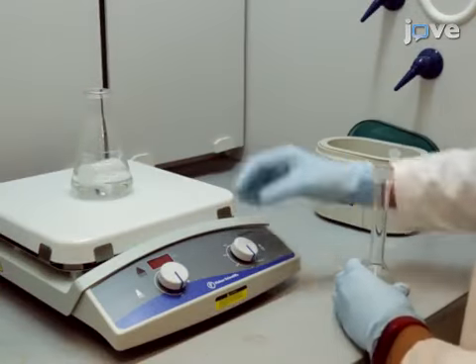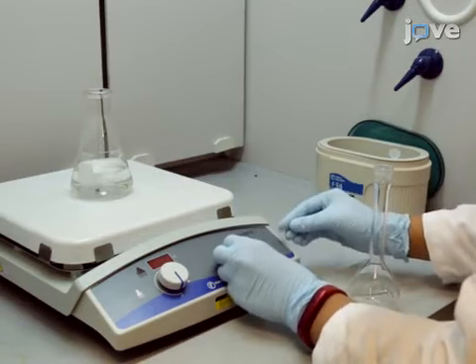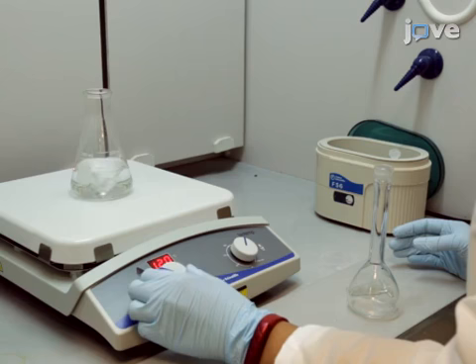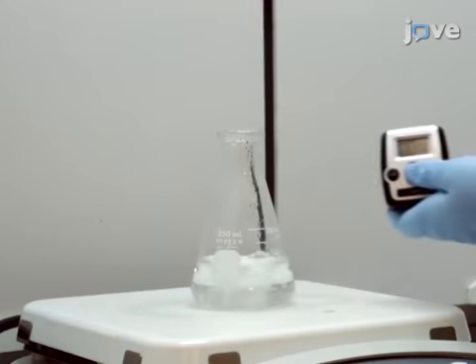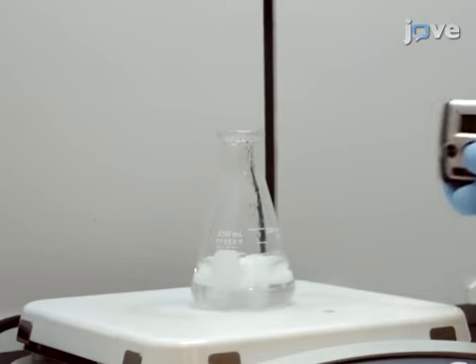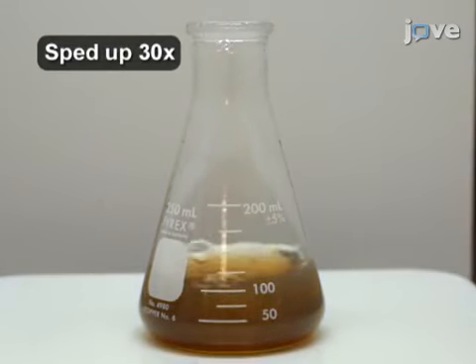To begin, prepare 100 milliliters of fresh silver nitrate solution and heat it to boiling on a 350 degrees Celsius hot plate with magnetic stirring at 700 RPM. Once boiling, immediately add 1 milliliter of freshly prepared sodium citrate solution and let the solution boil for 25 minutes. As the silver nanoparticles form, the solution will turn greenish-brown.